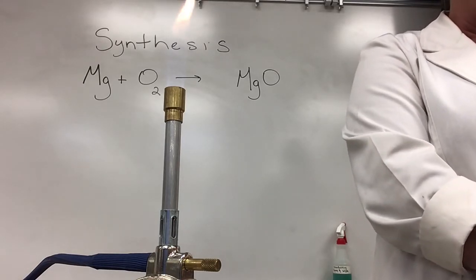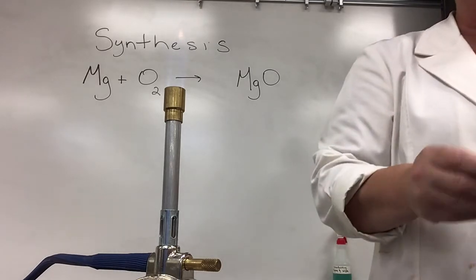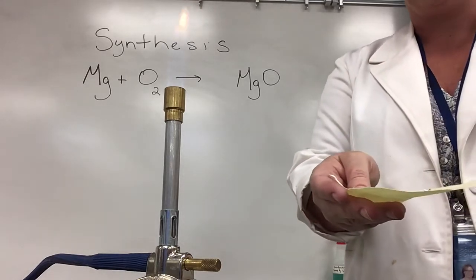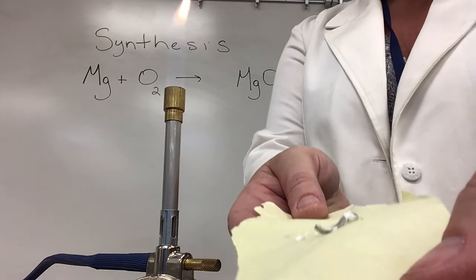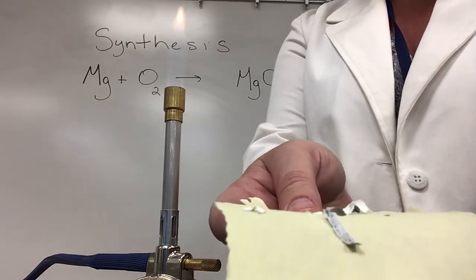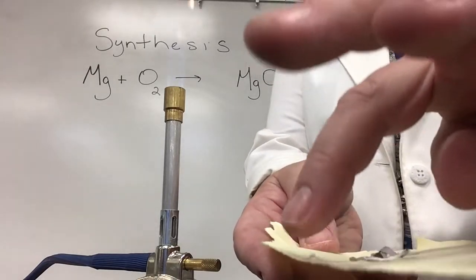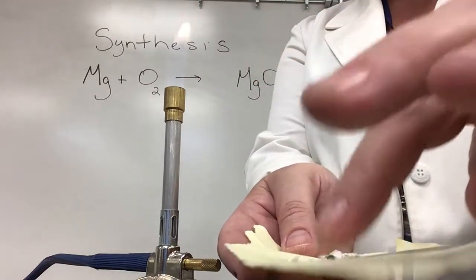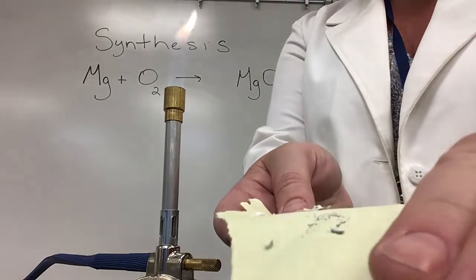This is the magnesium oxide as an ash and again instead of being that silvery color it's kind of grayish white and it's sort of chalky. It's no longer metallic in nature, it kind of just falls apart if I touch it.